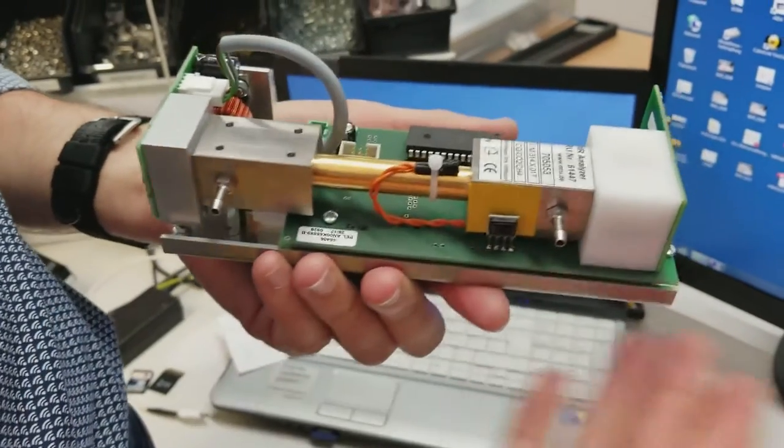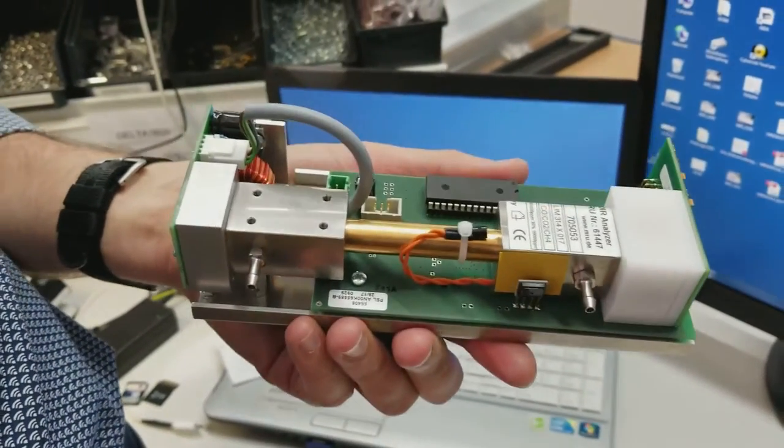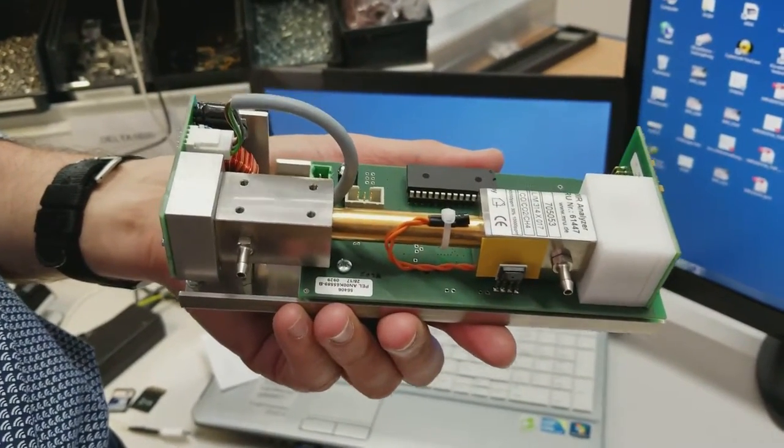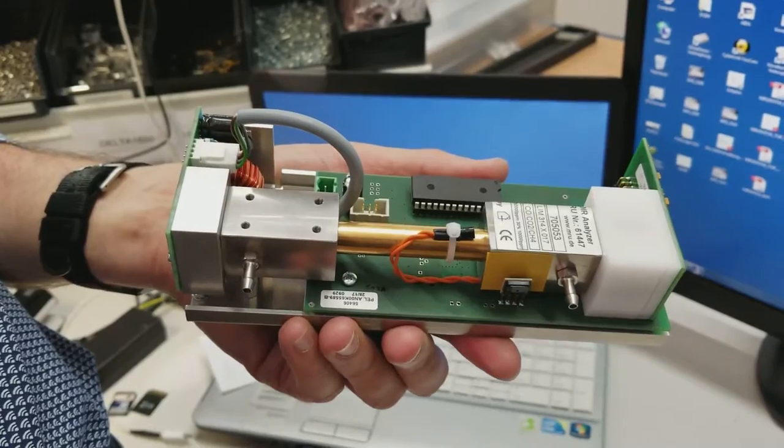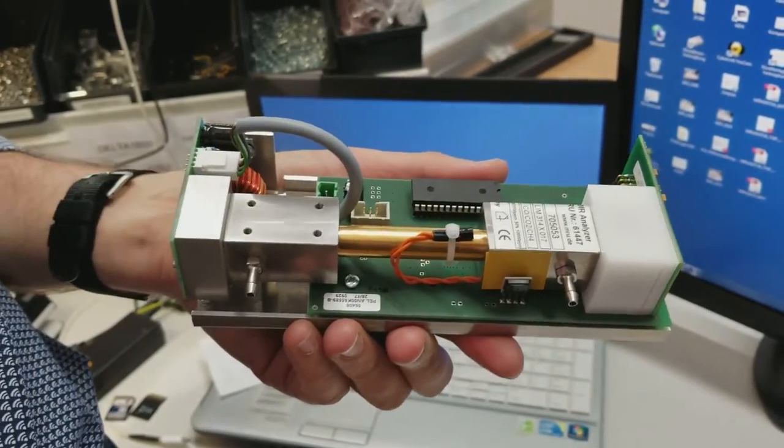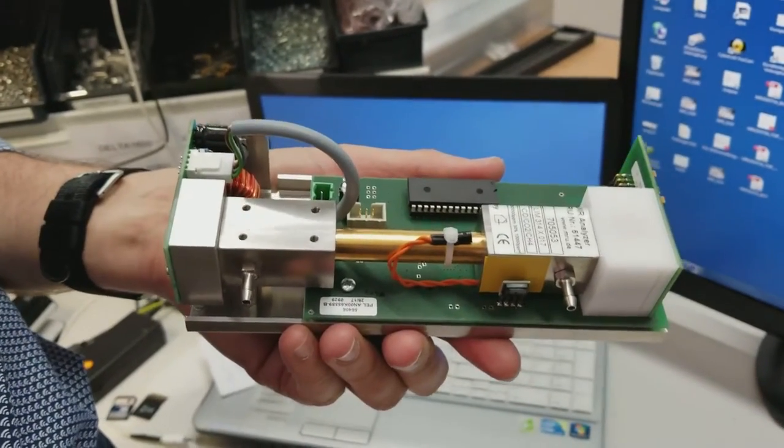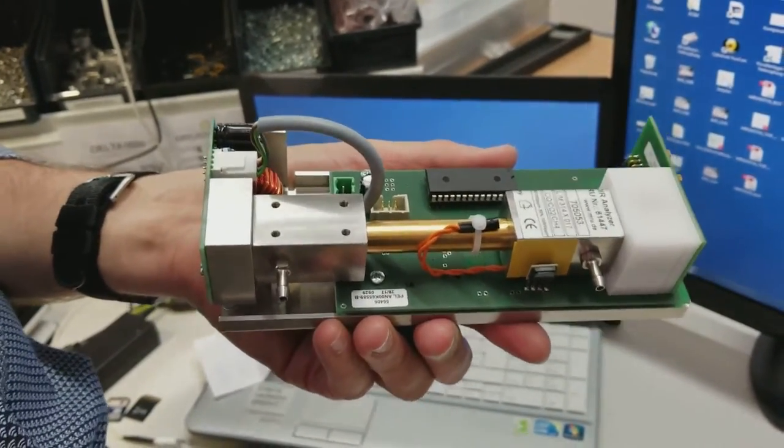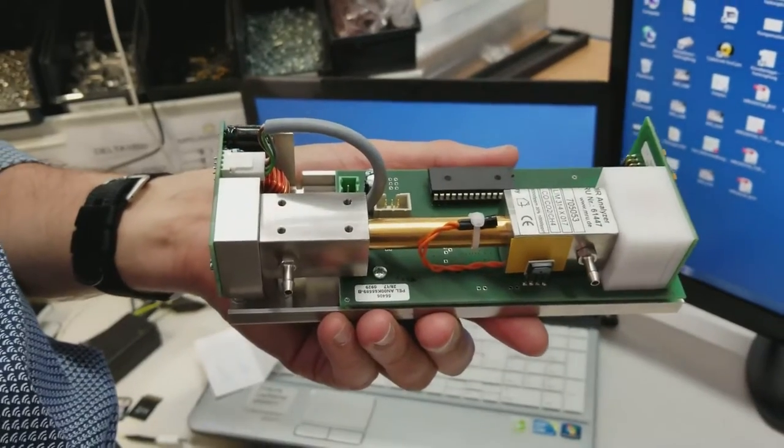An infrared bench that is able to measure four gases at the same time. It is mainly composed of an infrared source emitting infrared light between 1 and 10 microns wavelengths.